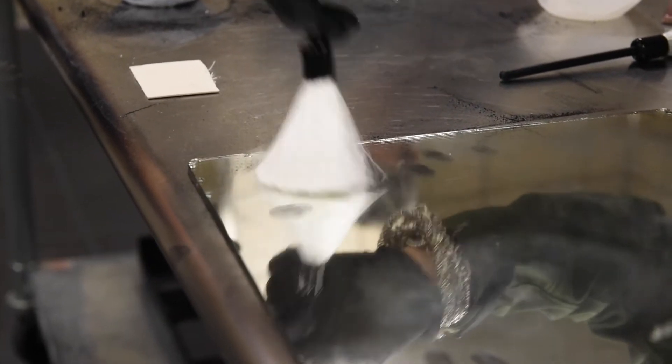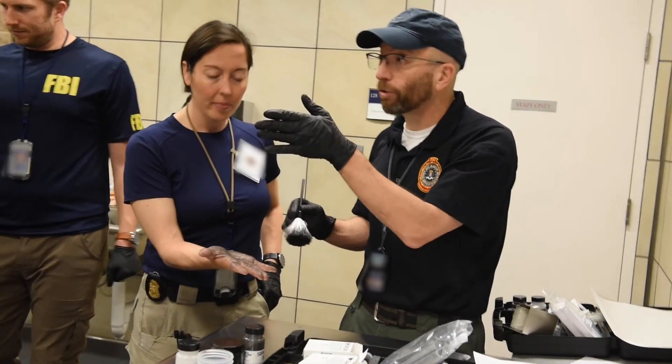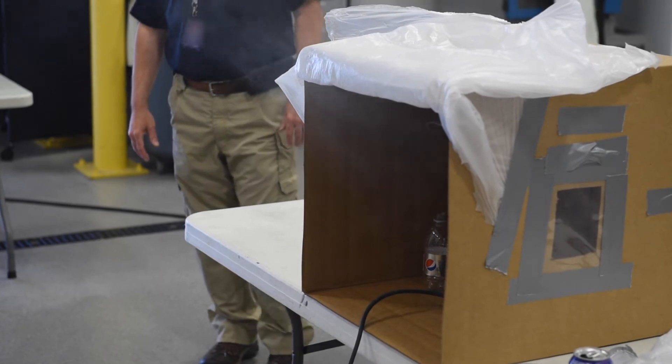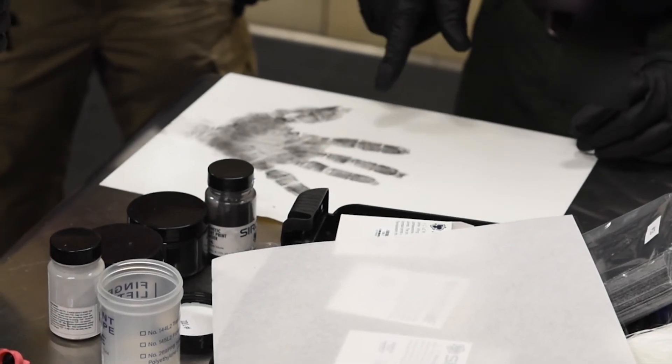And this is where we get a lot of the oohs and ahs. They finally start putting together — now I know what the instructors were talking about. I'm actually doing it. Now I know to stay away from the super glue chamber when you open it. I put the print on there, I put the super glue, I can see the flashlight and then it pops up. It's almost childlike — that aha moment that we wait for as instructors.